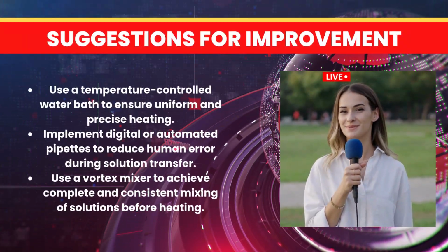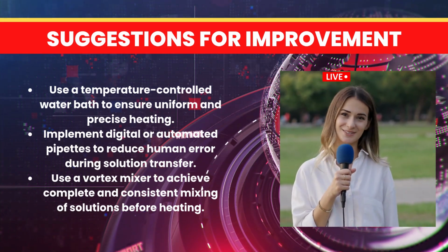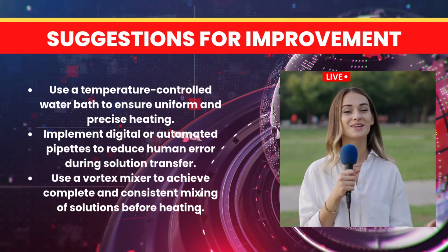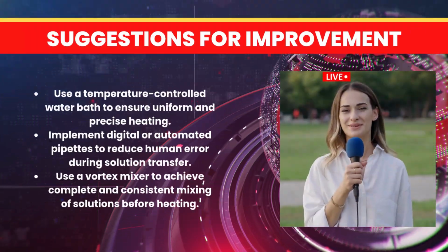Suggestions for improvement. Use a temperature-controlled water bath to ensure uniform and precise heating. Implement digital or automated pipettes to reduce human error during solution transfer. Use a vortex mixer to achieve complete and consistent mixing of solution before heating.